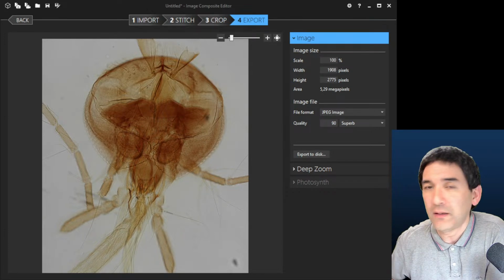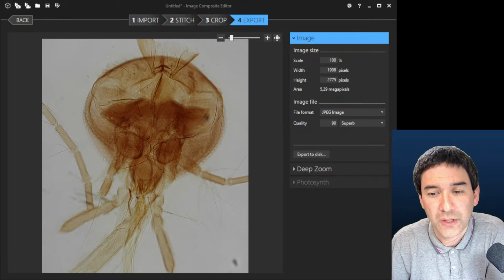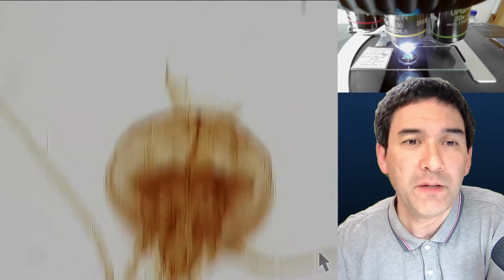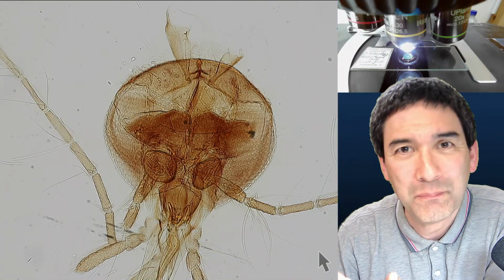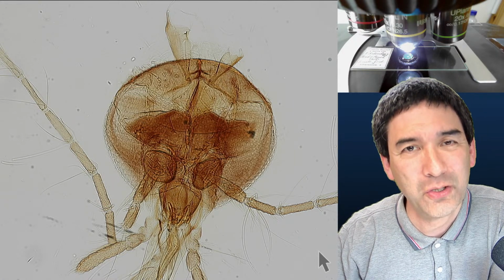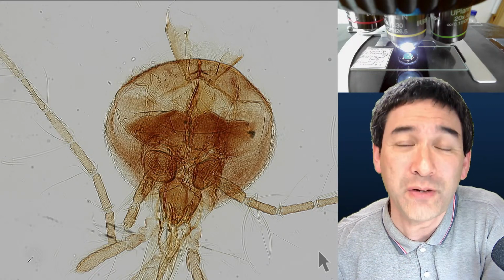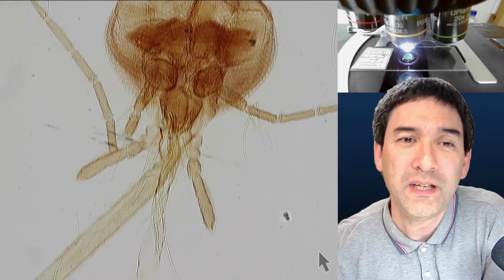If you take a video and move too fast, I just want to show this to you. Let's go back again to the scope view. If I make a video and move too fast, you get motion blur. That means the individual frames also look blurry, and then you do not get a good quality either. So you have to make sure that either the shutter speed is very high, or that you move slowly enough for the video.